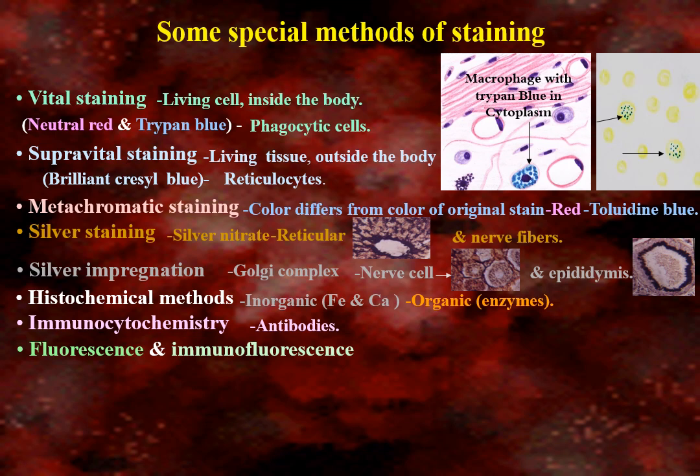Fluorescent and immunofluorescent methods, in which certain substances and antibodies are labeled with a fluorescent dye to emit visible light to be detected by the fluorescent microscope.